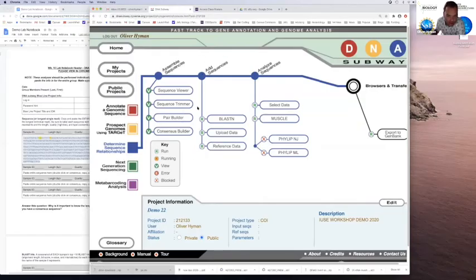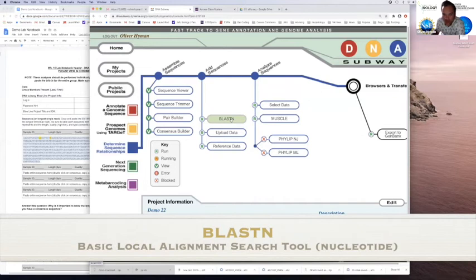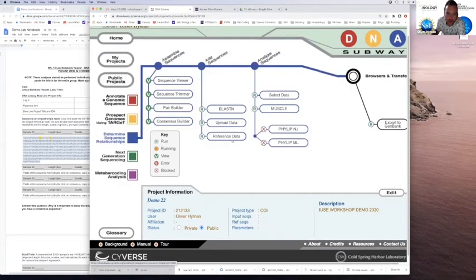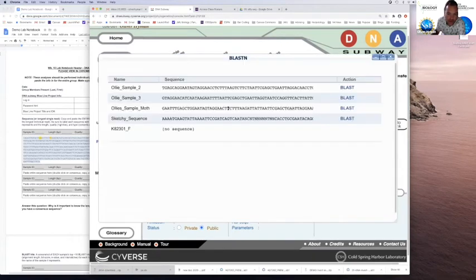So now we're going to go to this next step called add sequences. So I'm going to hit this thing called BLASTN. Essentially, BLASTN is a Google search for your DNA sequences. So this is automatically dropping your sequences into an NCBI database BLASTN search. BLASTN stands for blast nucleotide. Oops, close that out. So I'm going to go and hit this BLASTN thing.